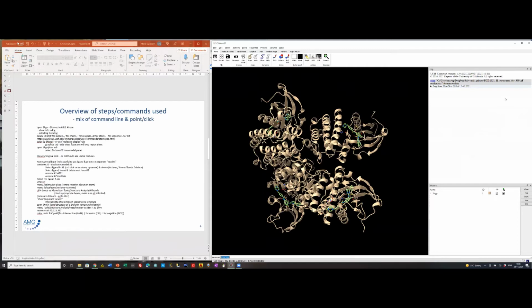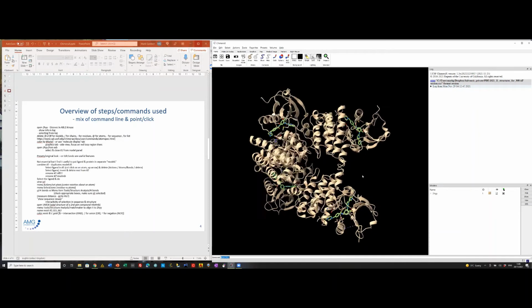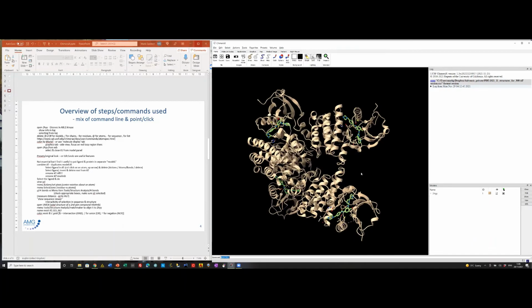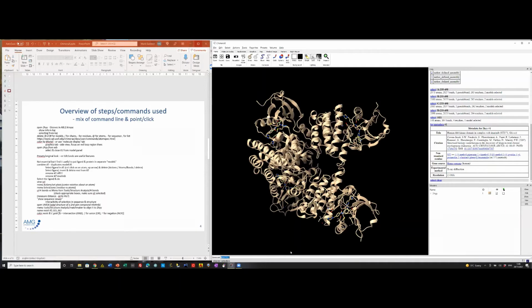Maybe there's a bit of a delay because I'm doing a video session here, but usually that comes up with more information quite quickly. Doesn't seem to be playing ball now, never mind. As usually you'd be wanting to focus on just one copy of the protein ligand interactions. They're usually almost identical. I'm going to get rid of 3 of them, and there are various ways, as is common in ChimeraX, to do that. Okay, you can see now finally the additional information's come up, the reference and things like that.